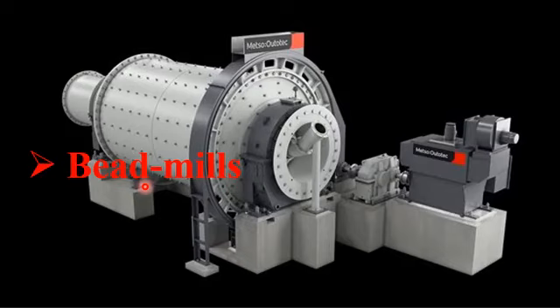Beads inside the grinding chambers are agitated by a rotating shaft, and the particles are ground and dispersed by the collision and shear force of the beads. In a bead mill, the beads act as a grinding medium, causing collision and shear with the bulk material, and in this way the bulk material is converted into a fine material.